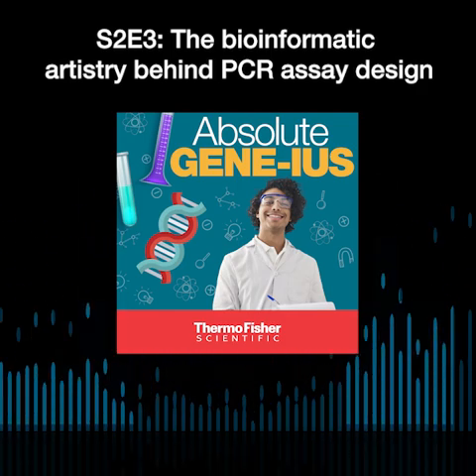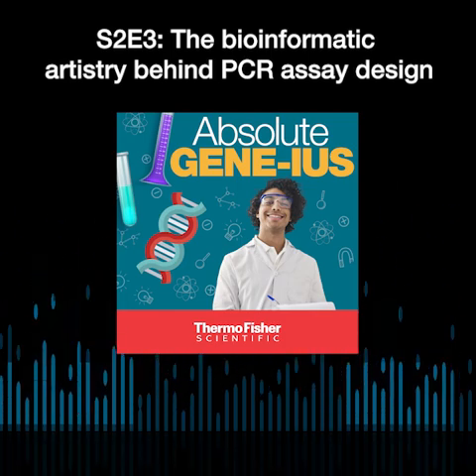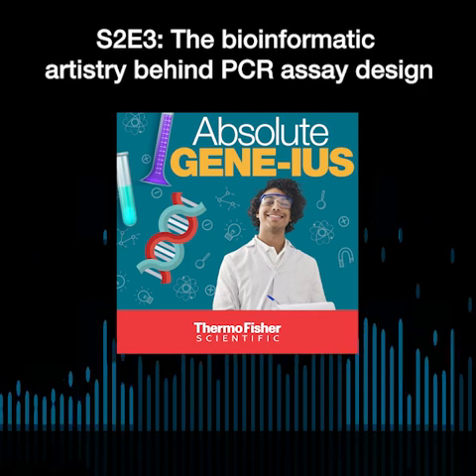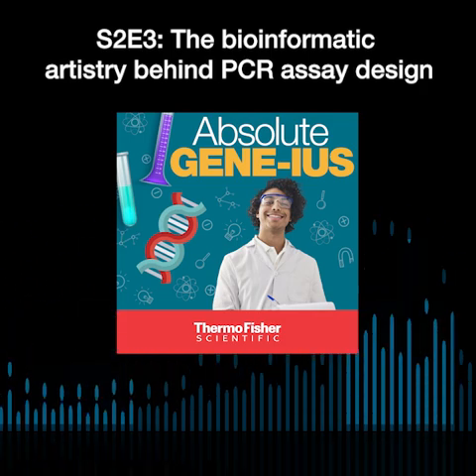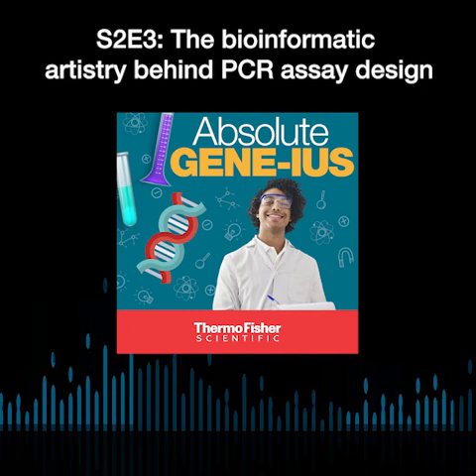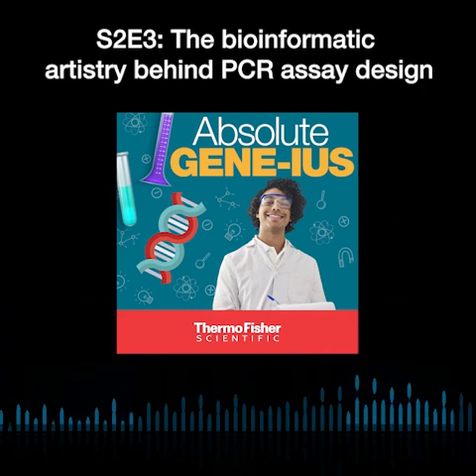Is that a good kind of summary? Yes, yeah. I like to take a step back and think of the application. And I like to go from the application to the assay design and not just let's just design for this target.